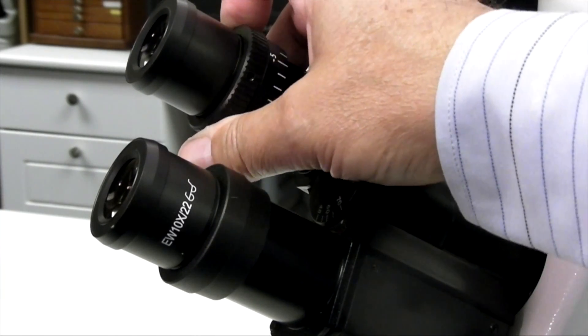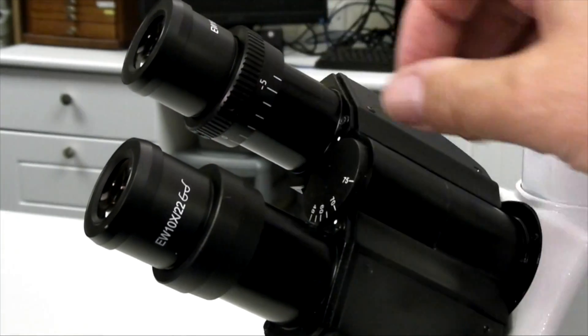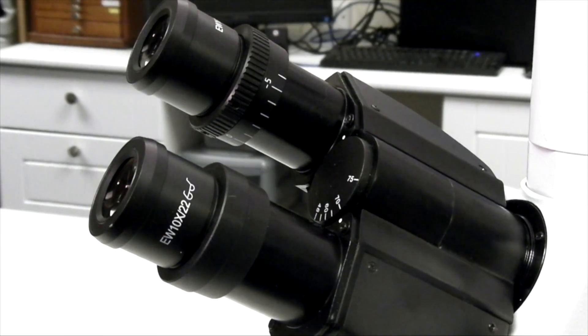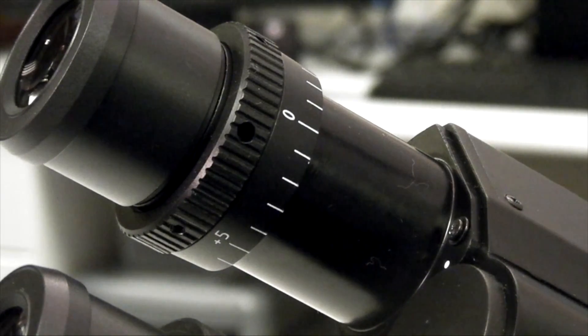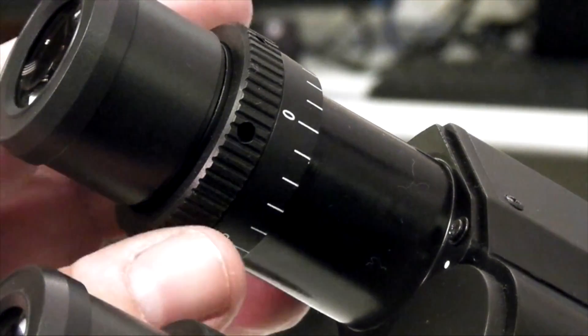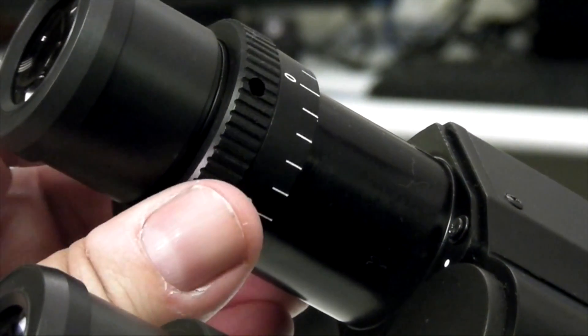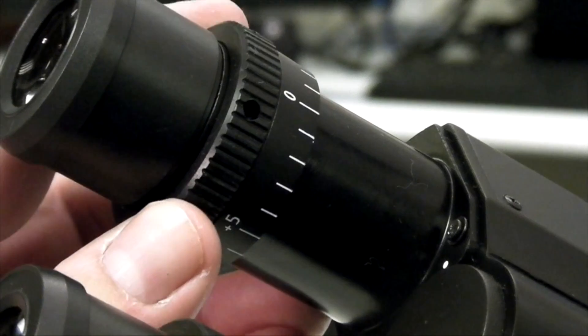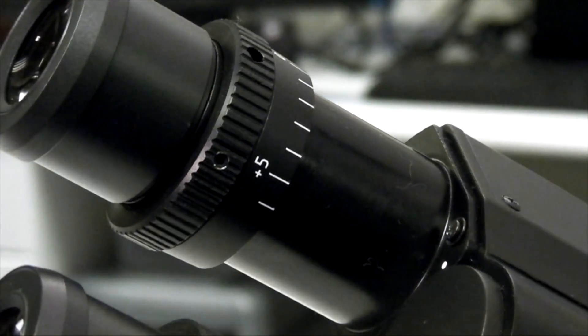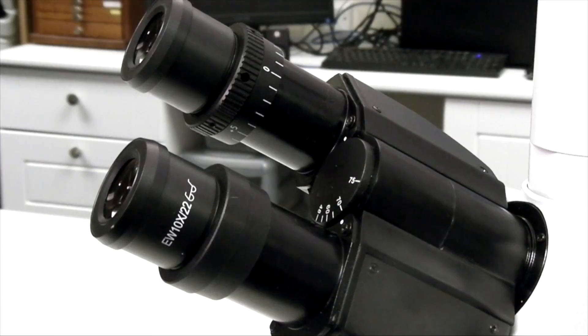Focus the specimen with the microscope controls. Close this eye and open the other, and without altering the controls of the microscope, move the dioptric ring of the focusing eye tube in either direction until the specimen is in focus for that eye as well. The binocular head is now aligned for distance between the eyes.